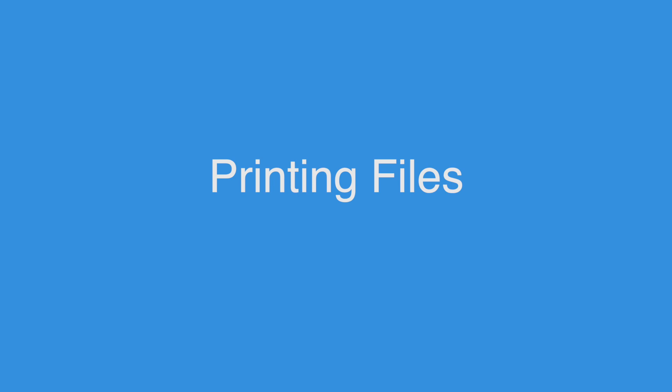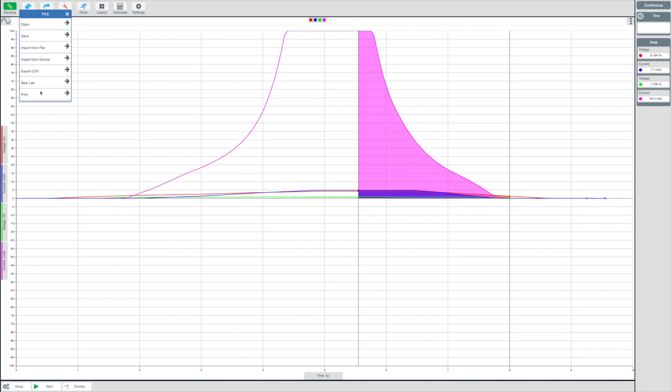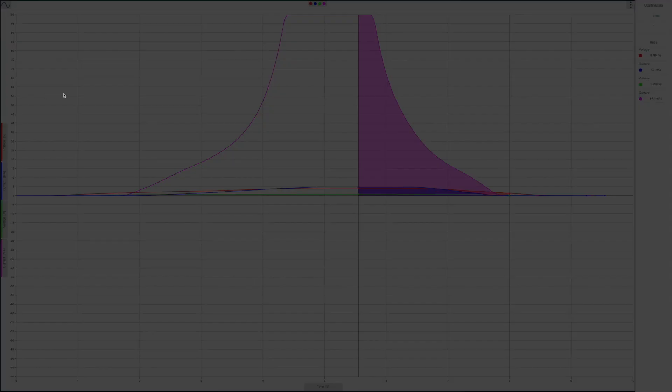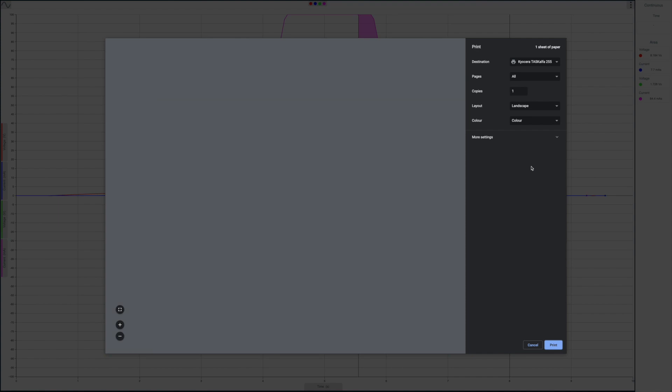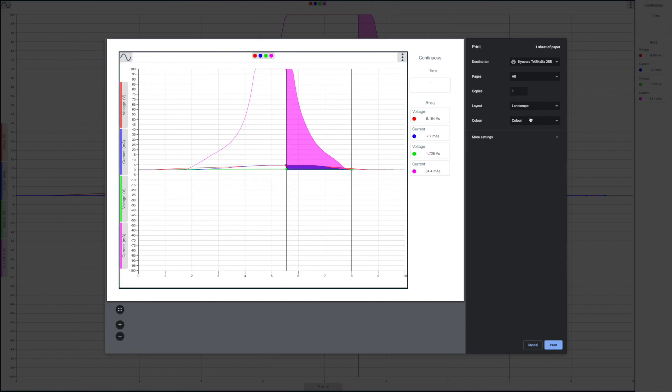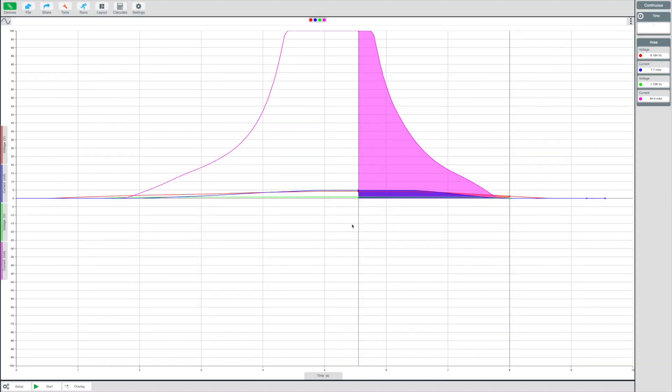Before we look at the new lab options within the file menu, let's look at printing your graph for your own reporting. From the file menu, select Print to open the print dialog. For the best results, choose Landscape from your printer's layout settings and then select Print.